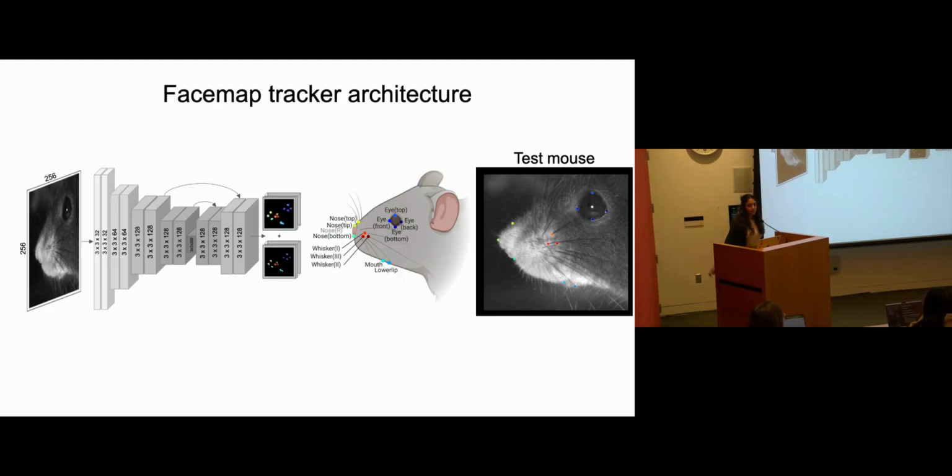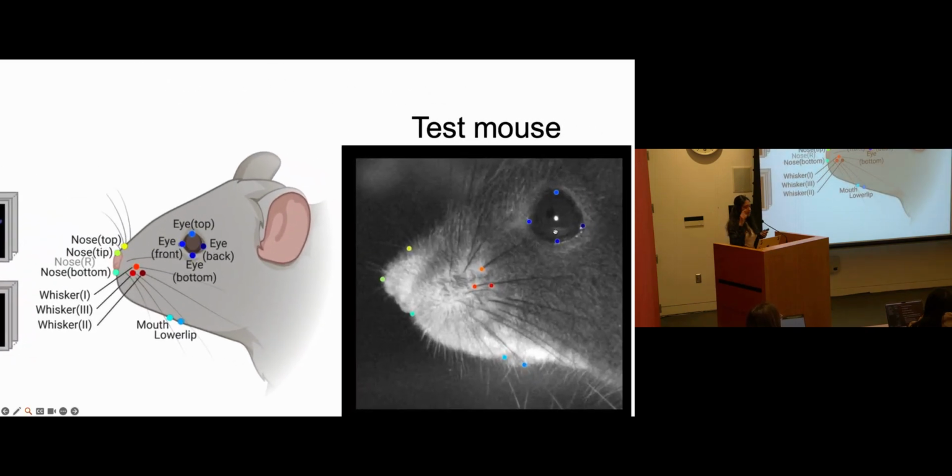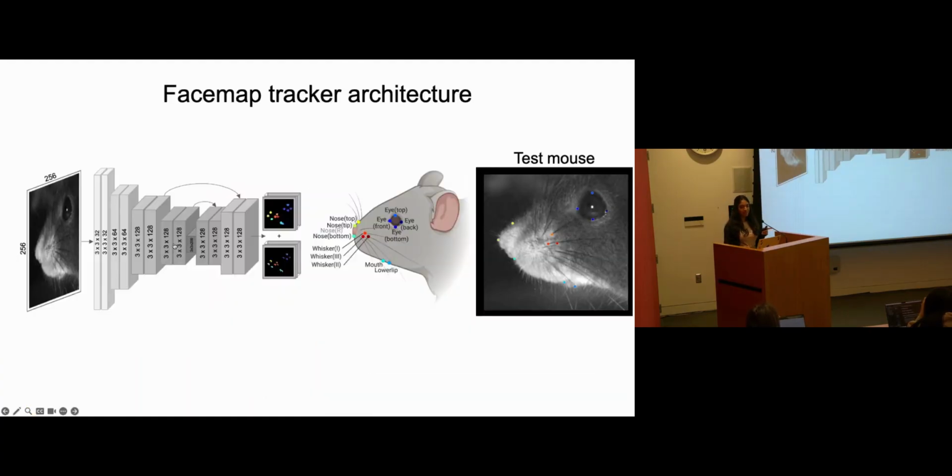Yeah, so the previous version of FaceMap that Carsen had still does the pupil size tracking. Maybe I don't have a video here, but basically you draw an ROI around the pupil, change the saturation. So we'll have a circular or elliptical ROI and then track the center of mass of that position. That's also something we've been doing more for my current project, which I won't cover today, but you can check out FaceMap for that. These are in total darkness, so you can't really see the pupil area, but we have some cool things. We track pupils in darkness.